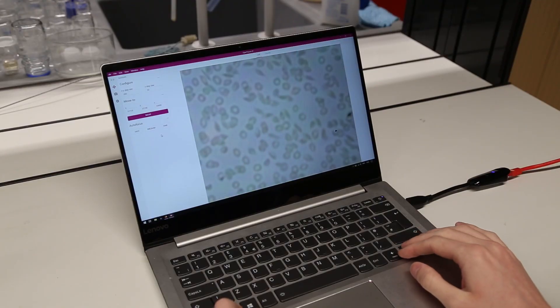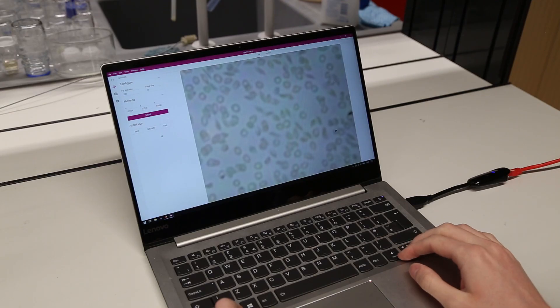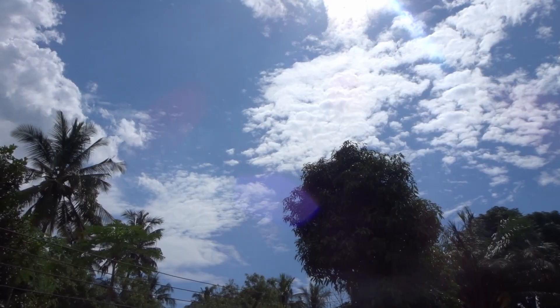The OpenFlexure microscope is powered by a Raspberry Pi and can be connected to the internet, which means the microscope can be controlled remotely in places such as here, in Tanzania.